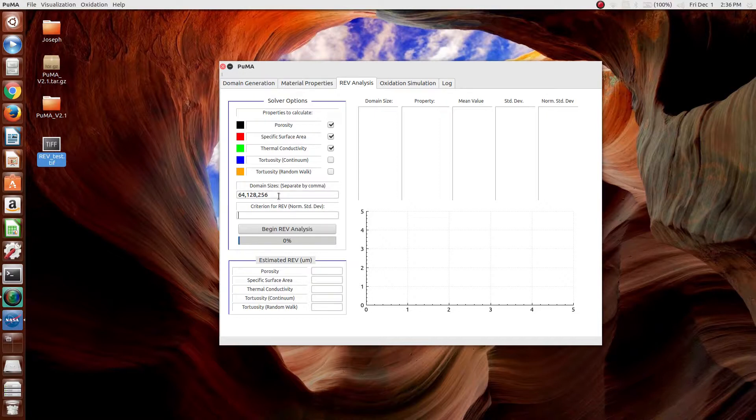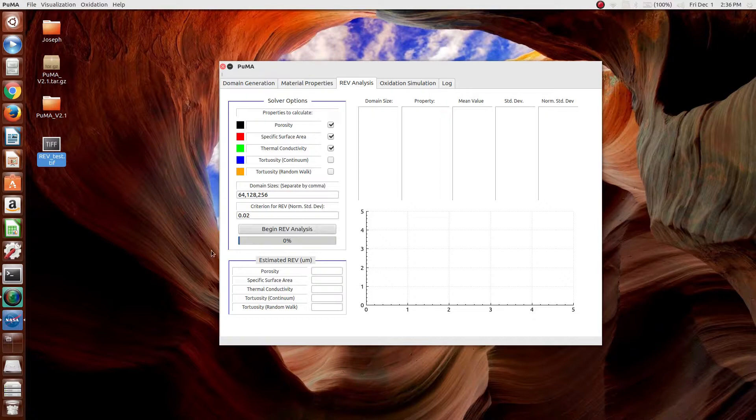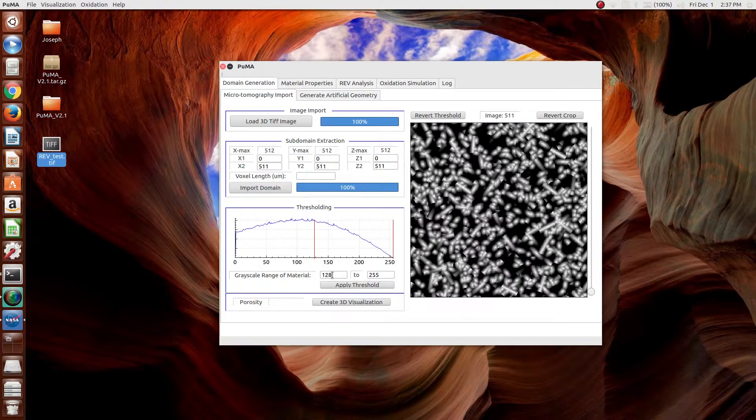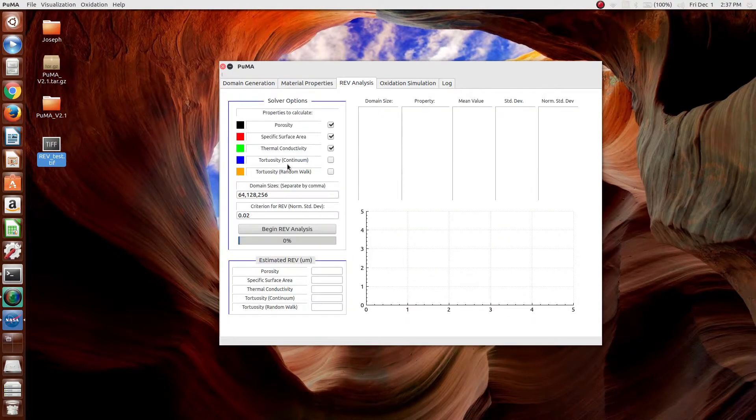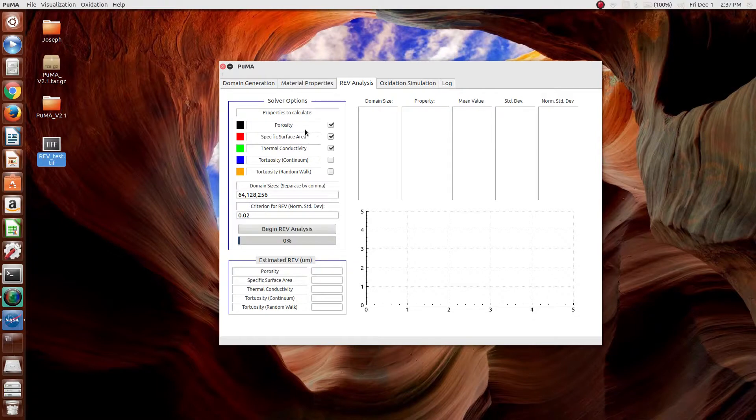The criterion for REV is usually 1 or 2%. In this case, we'll go 2%. Now, in order to run the representative elementary volume analysis, we have to make sure that all the inputs required for each of these things has been set.